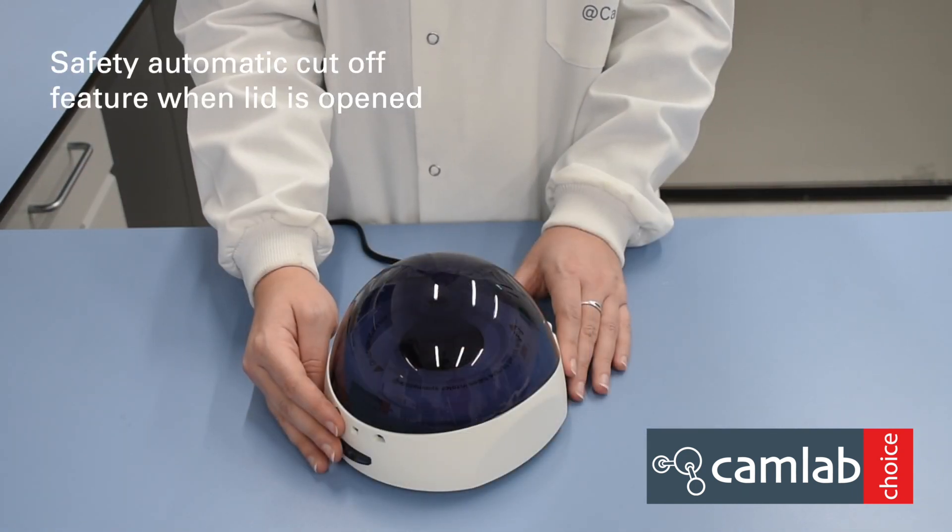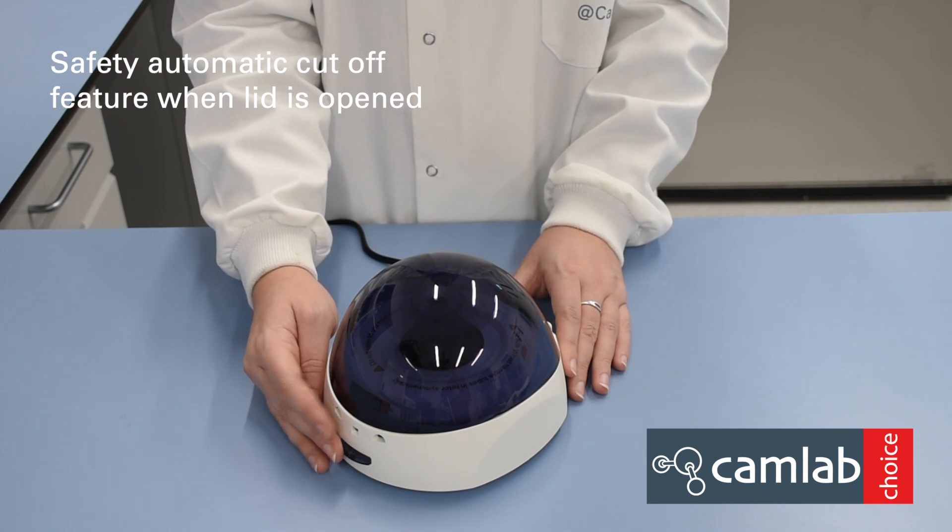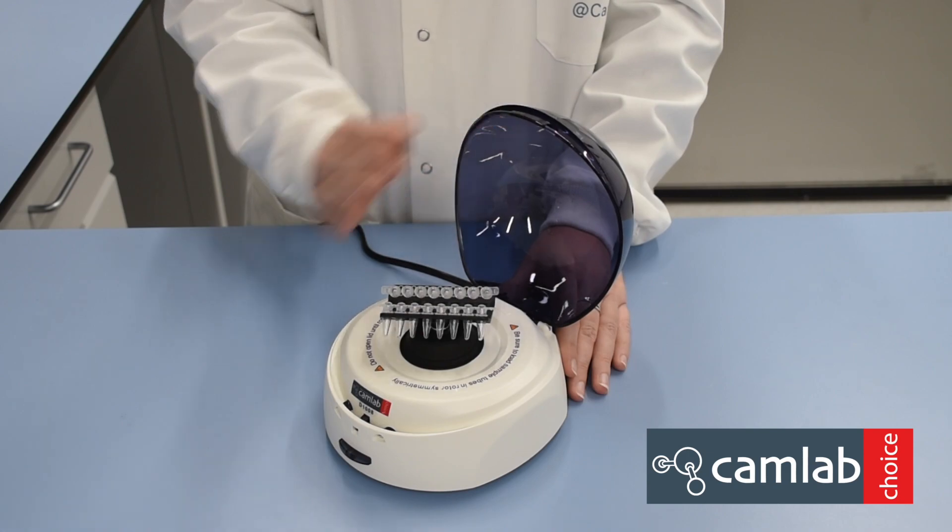The centrifuge has an in-built safety feature whereby if you open the lid whilst the rotor is running, it will automatically stop.